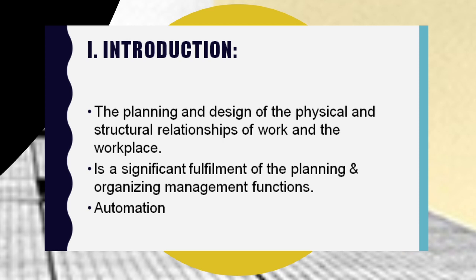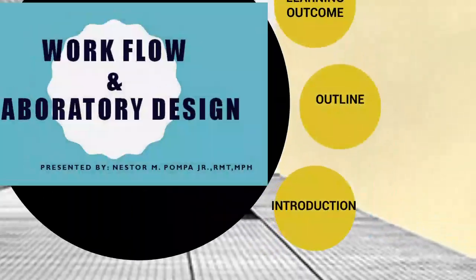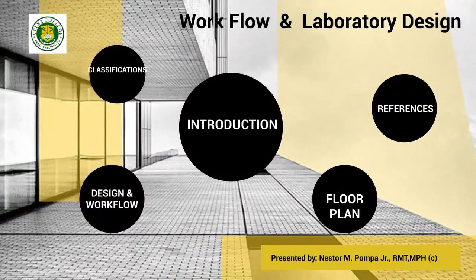Thus, a good understanding of laboratory design issues that affect space, workflow, cabinetry, equipment, ventilation, lighting, plumbing, electrical, and data is important to enable personnel to work easily and efficiently, responding to technological and procedural change.